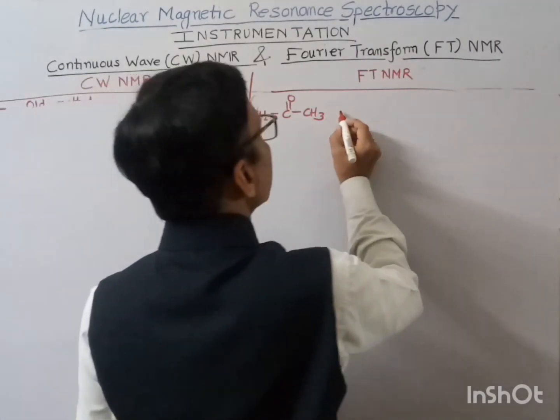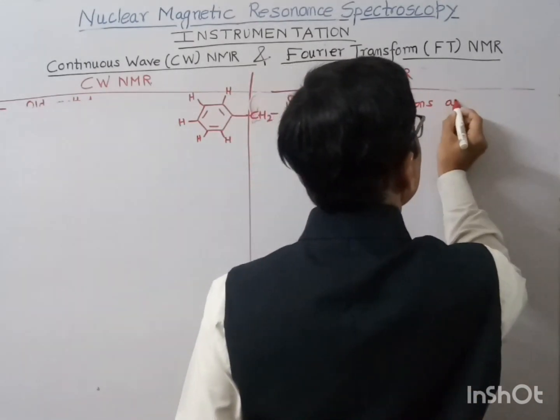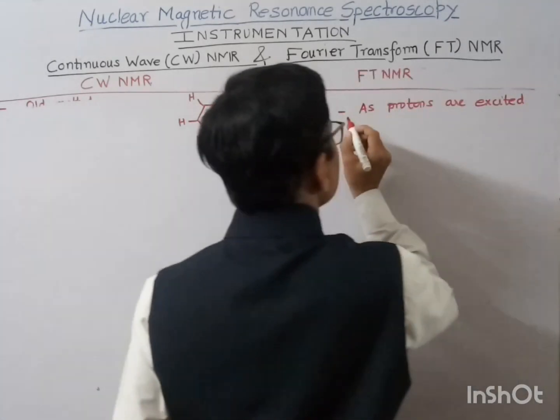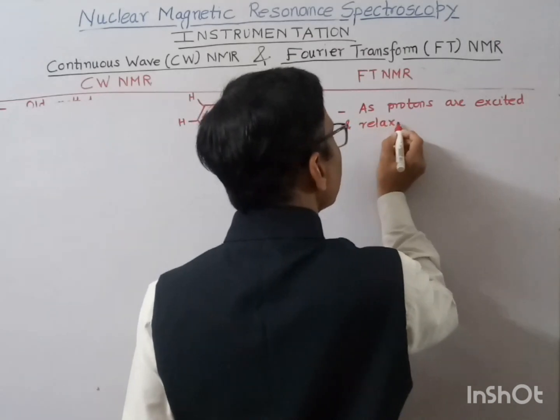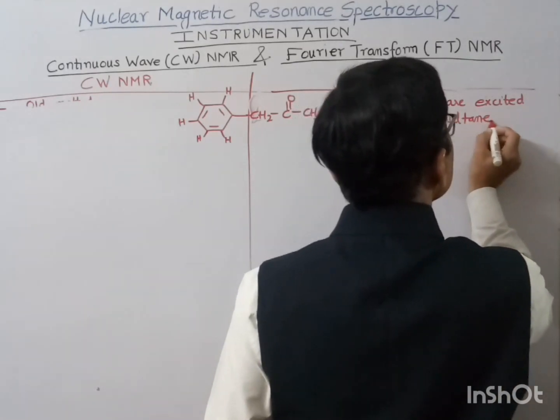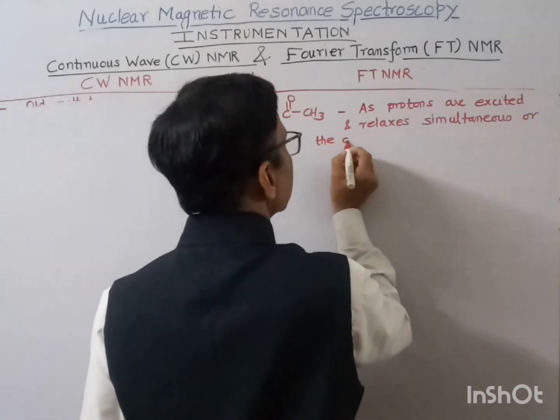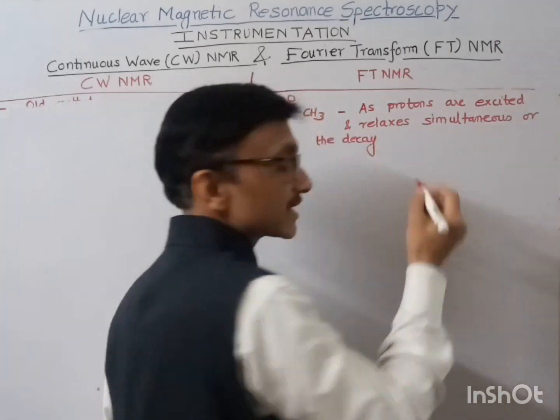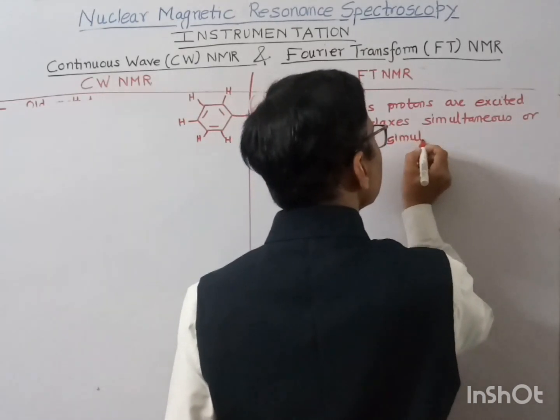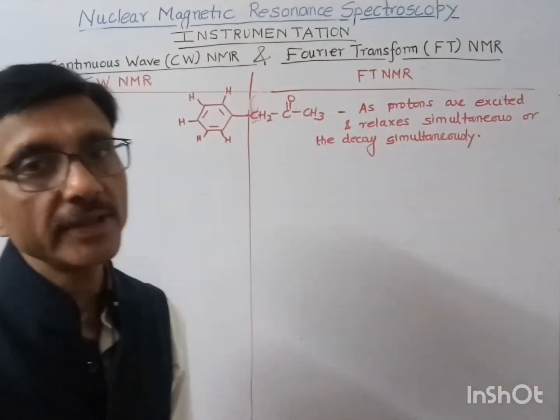So in FT-NMR, all protons are excited and relax, or decay, simultaneously. This process is called free induction decay.